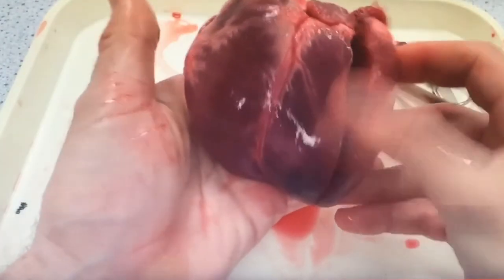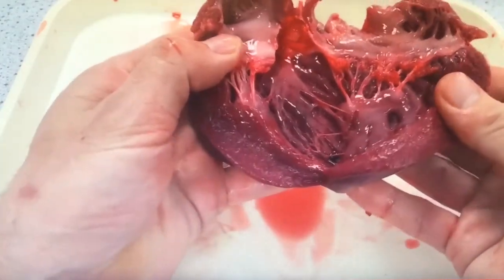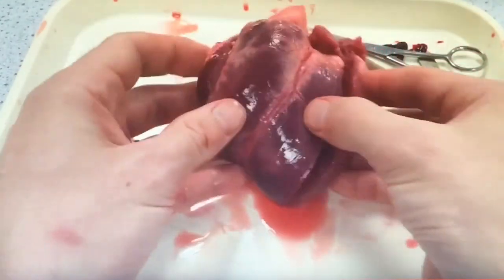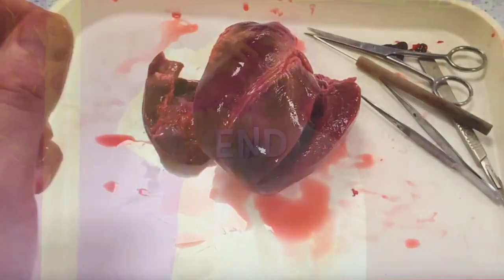A lovely dissection there. I hope you had a heart that you were able to manipulate and cut in all the right places. In some places hearts can have lots of odd cuts and be difficult to work with. Get photos and get them stuck in your book.